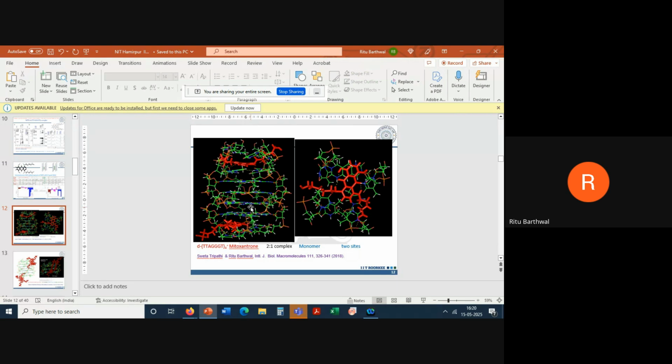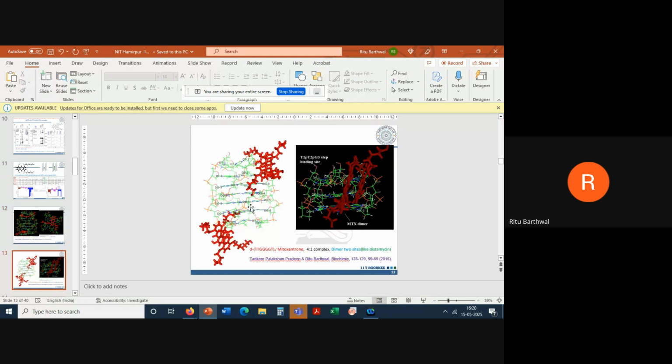And you know what? In absorption and fluorescence, I was getting a stoichiometry of 2:1. So things will match because it's the same compound you have studied by OD or fluorescence or NMR. The only thing is NMR is relatively complicated, but it will give much more information. It will give you the structure. Coming to the next, this is another.